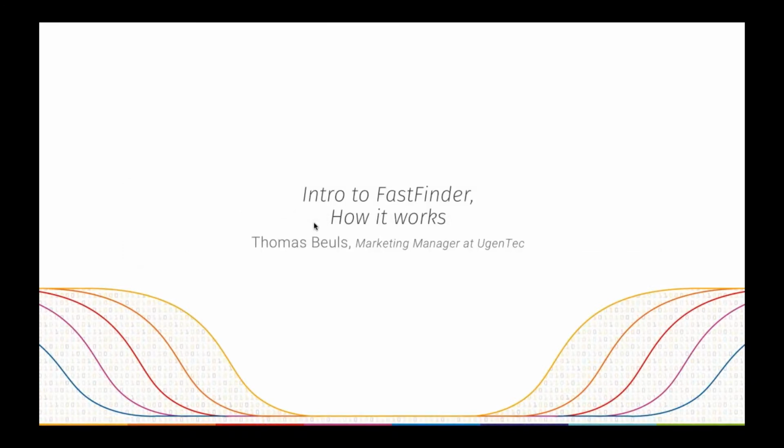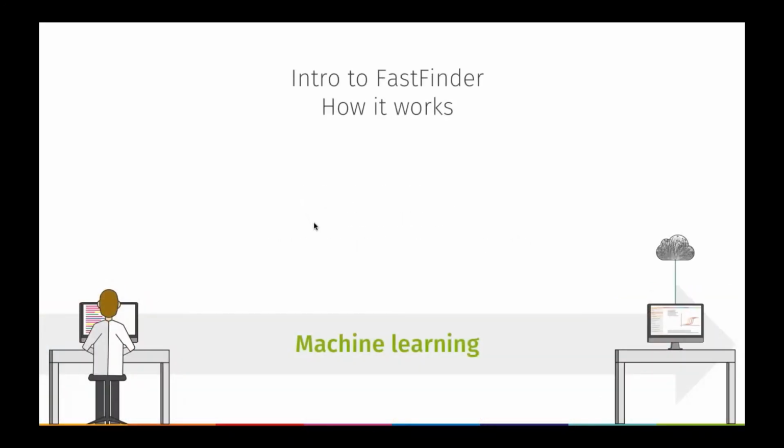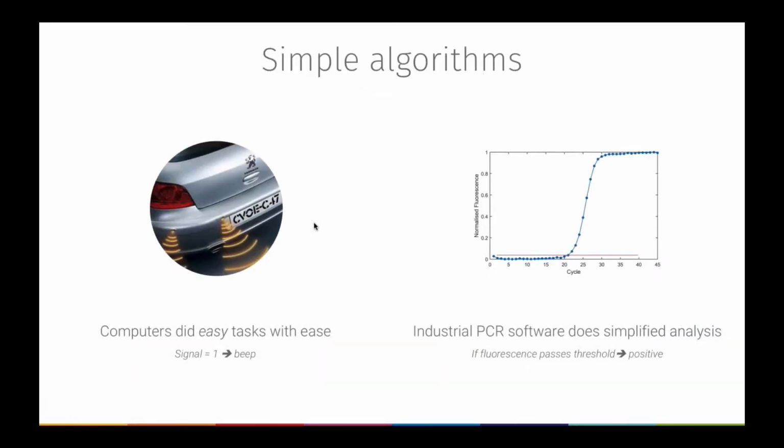So, starting with the intro to FastFinder, how it works. I will go over this briefly. So first up is machine learning, which is one of the core technologies used in FastFinder.